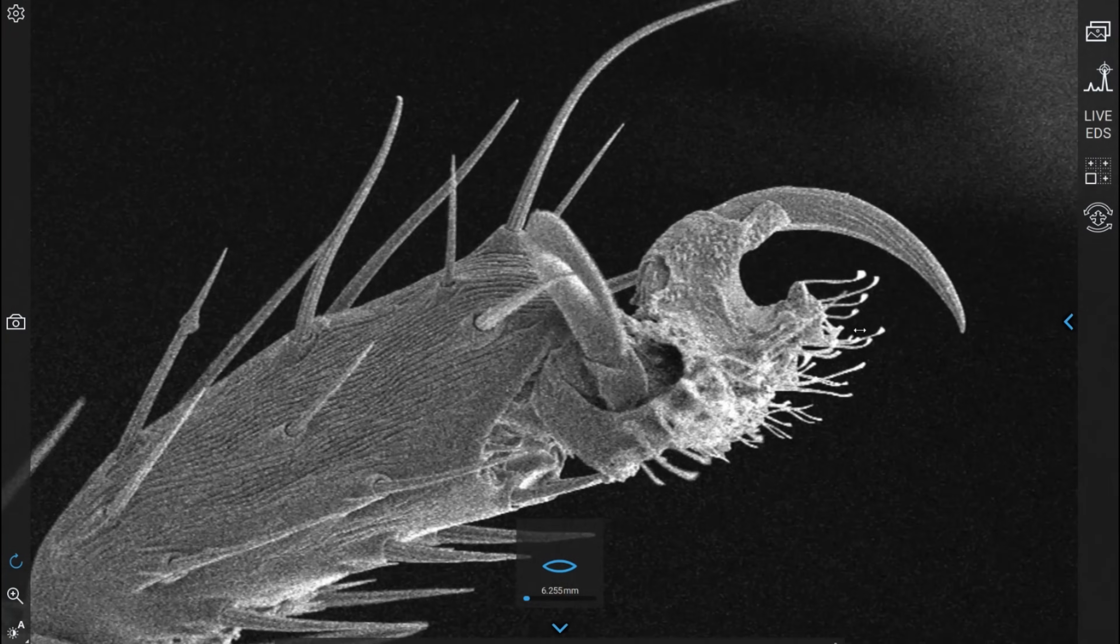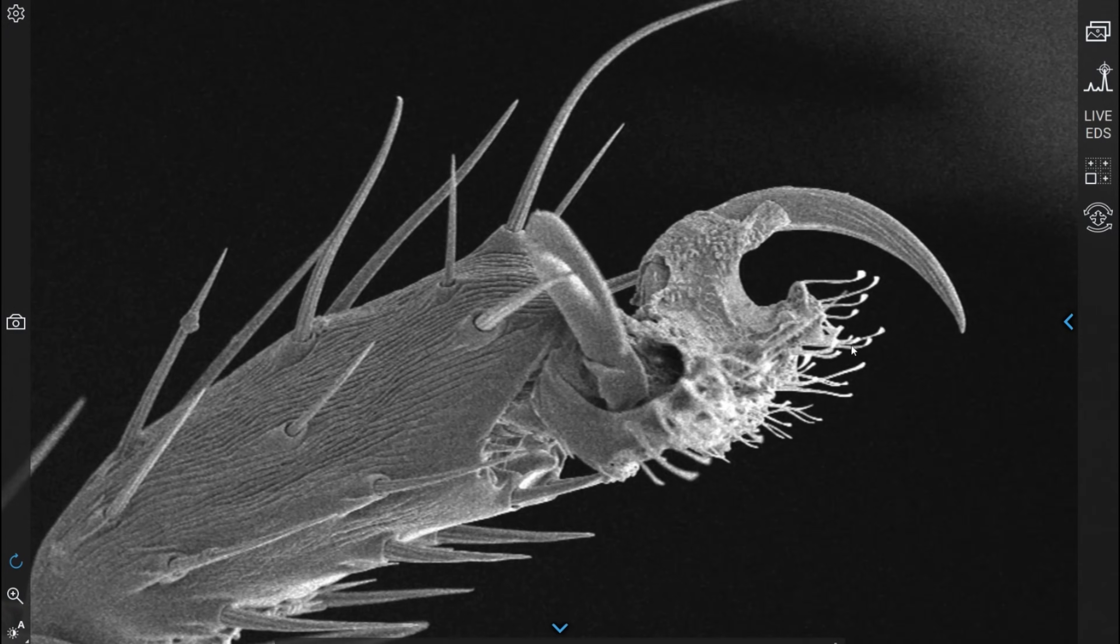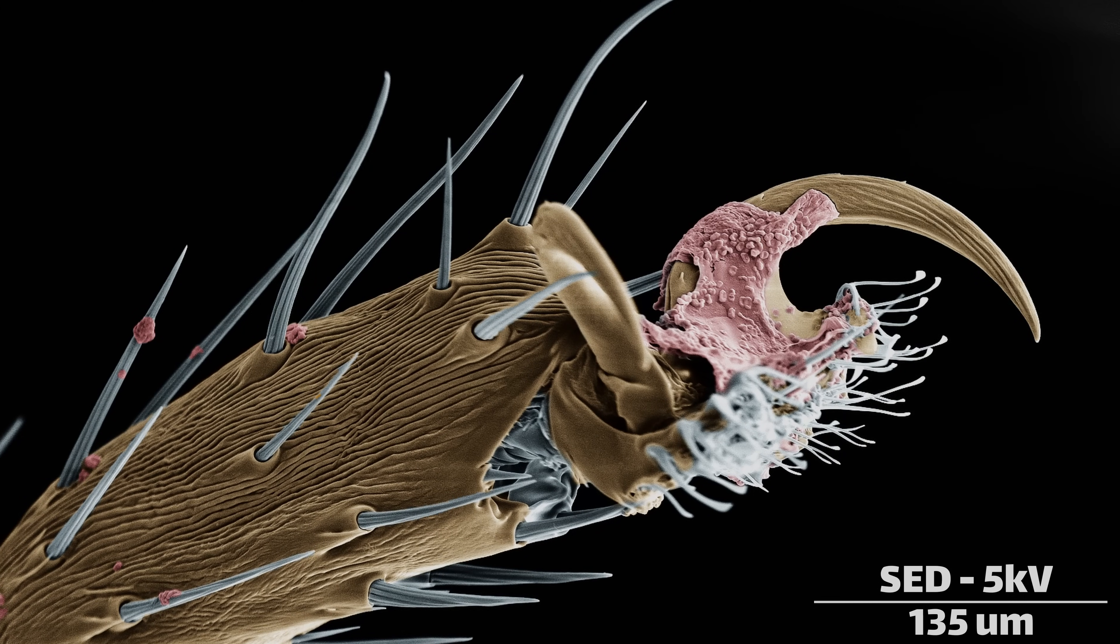These fine hairs secrete a sticky adhesive, which allows Drosophila to land on just about anything, and walk anywhere they wish to go, even upside down on the ceiling.